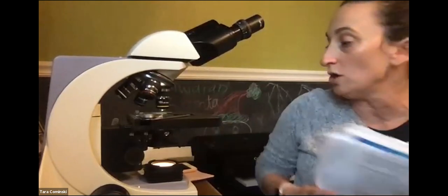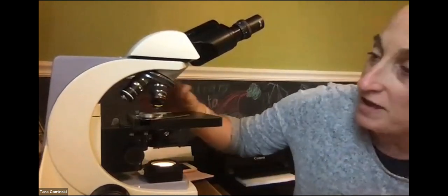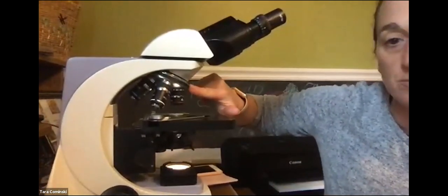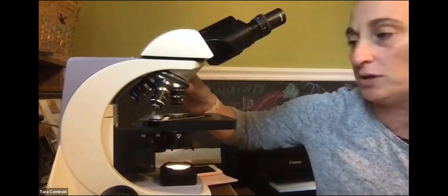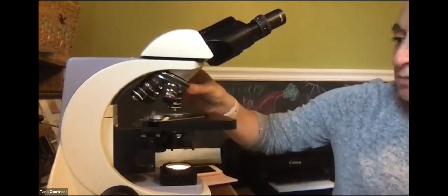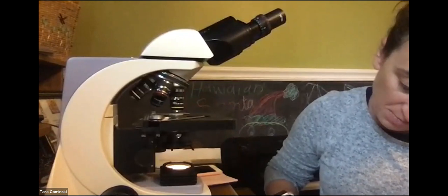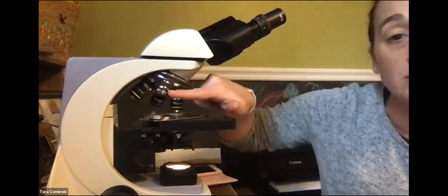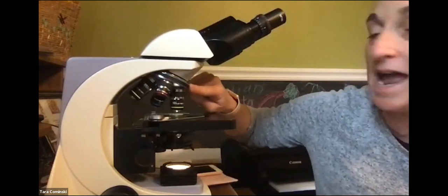If you look at those objective lenses, you see that they all have different magnifications, right? For this one that I have on there now, you can hopefully see, is the 4x objective. It's the shortest one, and in here it's marked red. They're not always color coded the same. Then if I turn this nose piece, the next one is 10x. So the scanning objective, it asks you what the magnifying power is, and the answer is 4x. For the low power, it asks what the magnification is, it is 10x.